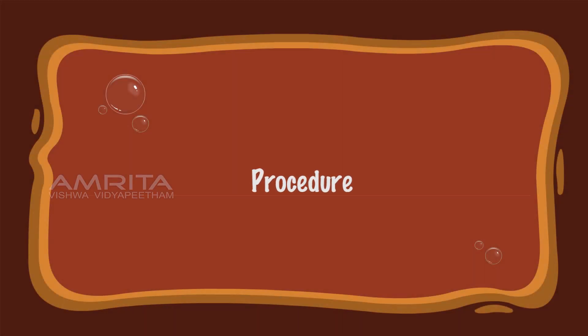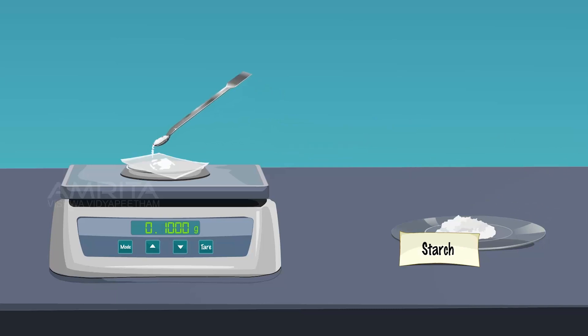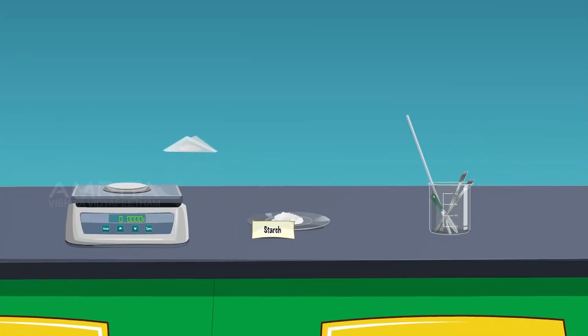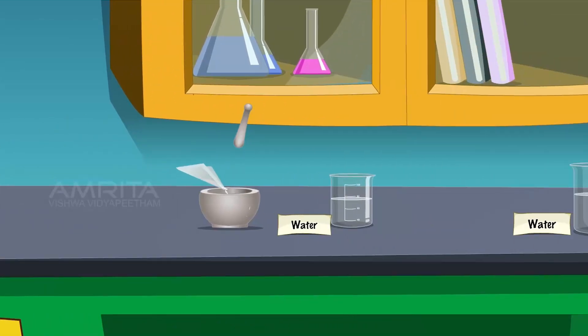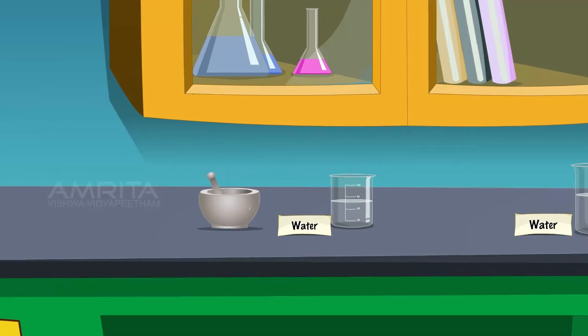Procedure: Weigh 1 gram of starch using the electronic balance. Transfer the weighed quantity of starch into the mortar and using the dropper, add a few drops of distilled water to it. Grind the starch with the pestle to make it into a thin paste.